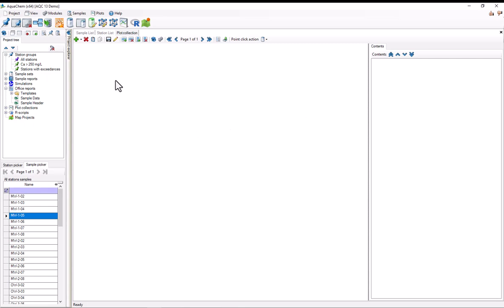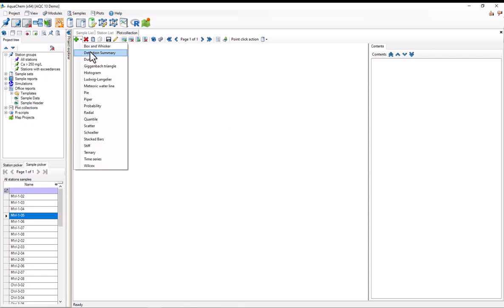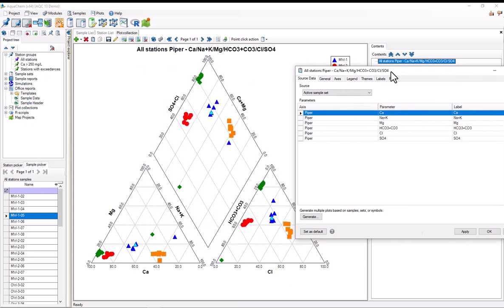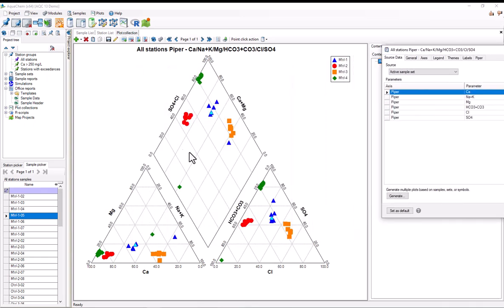This will open up a new tab for our new plot collection. Now, to add a plot, I simply need to select the green plus button and find Piper. This will open up a new window with the options for the plot. As we can see, by default, the Piper diagrams created by AquaChem will automatically have the major cations ternary diagram on the bottom left and the major anions ternary diagram in the bottom right.